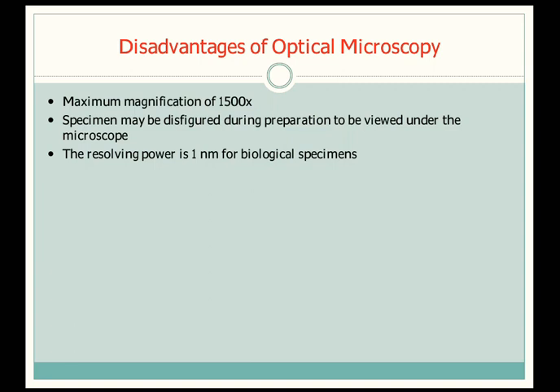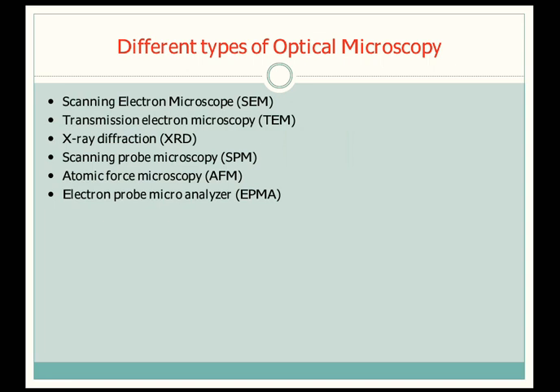So also, the specimen can be disfigured, that is, we can enlarge the image, and also we can cut the image. The resolving power is 1 nanometer for biological specimens. So the resolving power for biological specimens is 1 nanometer.